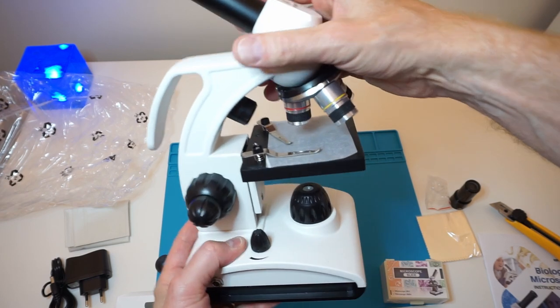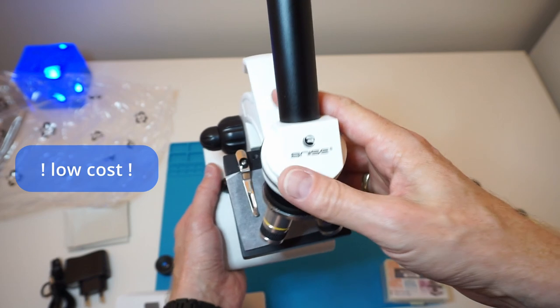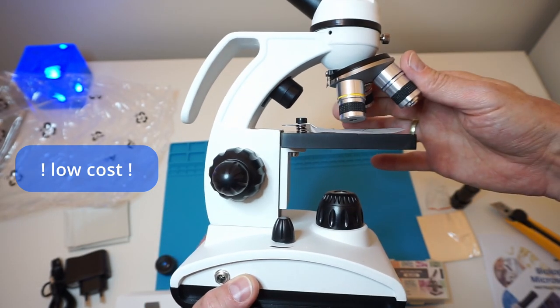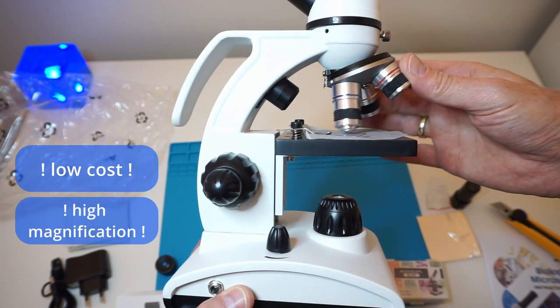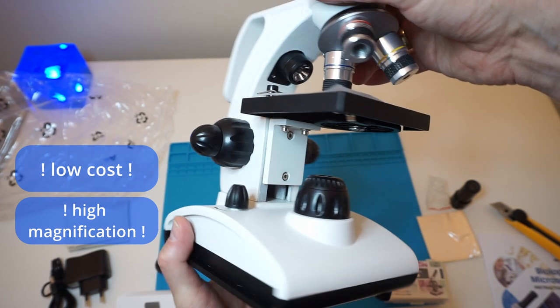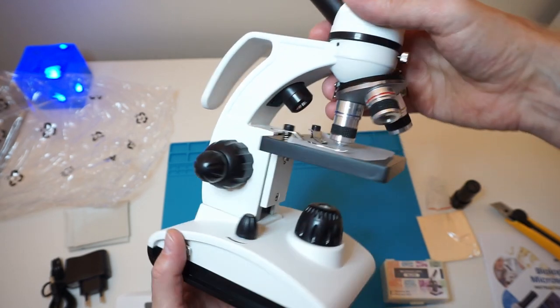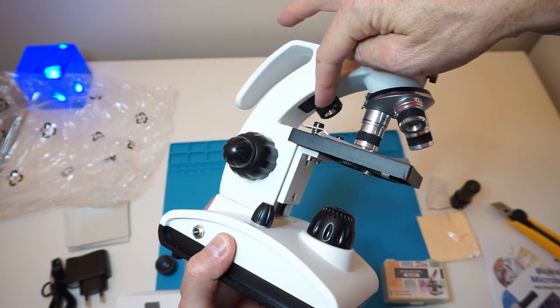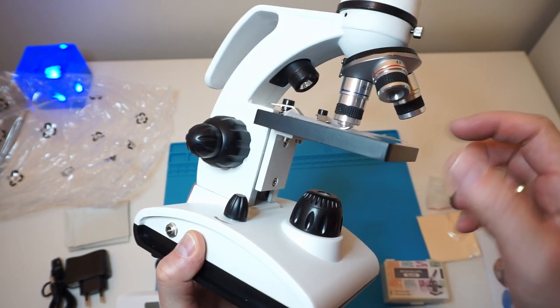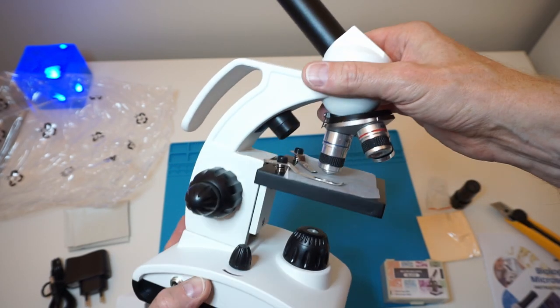The interesting thing of this device, and the reason why I bought it, was of course low cost, so it was 140 euro. It has a magnification up to 2000 times, which is I think what I read you need in order to have a look at the microstructure of dies. Important is that this is having a light not from below, because this is then in transmission mode where you can look at slices. That's what we're going to do.